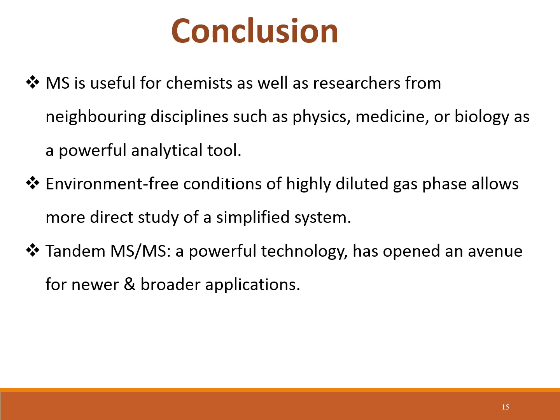In conclusion, MS is useful for chemists as well as researchers from neighboring disciplines such as physics, medicine, or biology as a powerful analytical tool. The interference-free conditions of the highly diluted gas phase allow more direct study of a simplified system. Tandem MSMS is a powerful technology that has opened a venue for newer and broader applications.